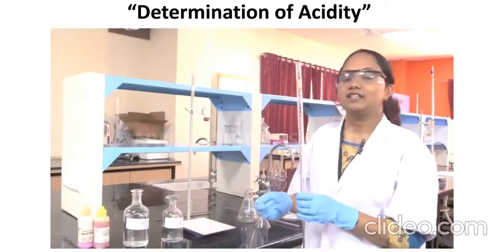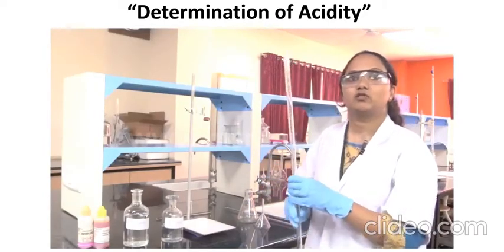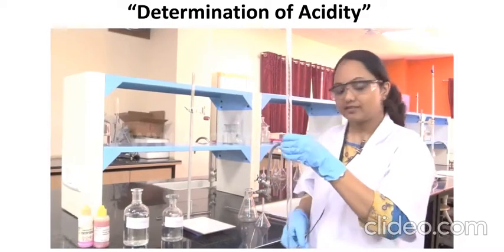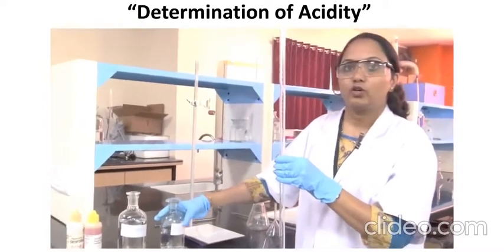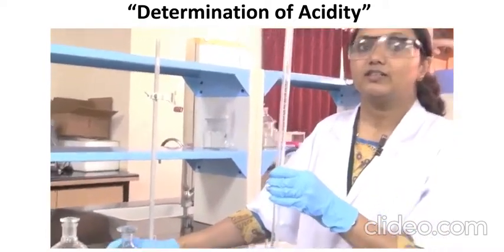After rinsing all the glasswares with distilled water, we have to rinse the buret with the standard NaOH, that is 0.1 normal sodium hydroxide.